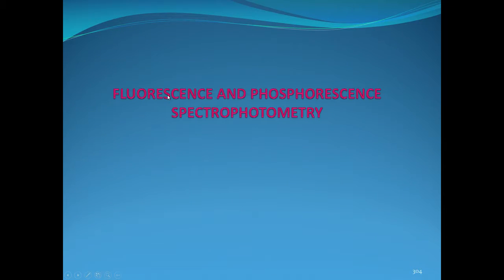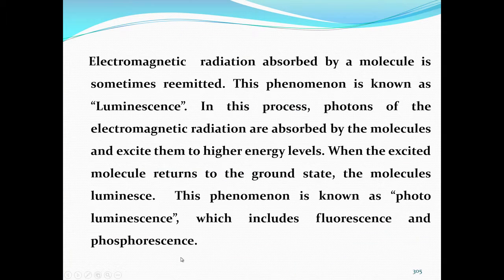But even though the accessory is available nowadays, yesterday I informed you that the fluorescence phenomenon studies and requirements in instrumentation and other things have necessitated the development of fluorescence spectrometry as a science of its own. Therefore, even though an accessory is available, you can also choose a dedicated fluorescence spectrophotometer. So, let us see what is fluorescence.